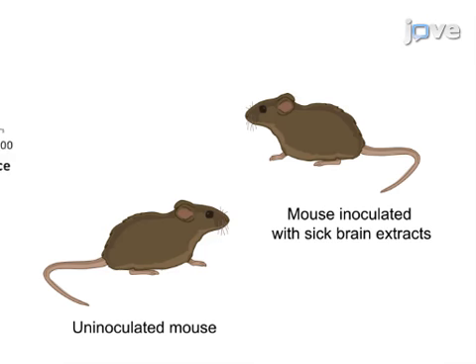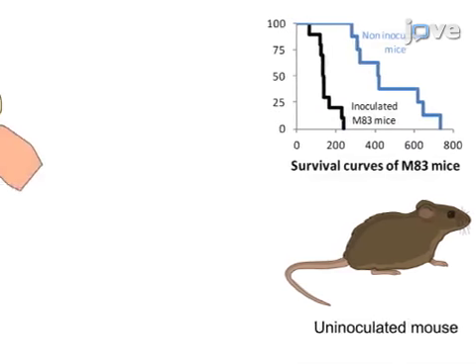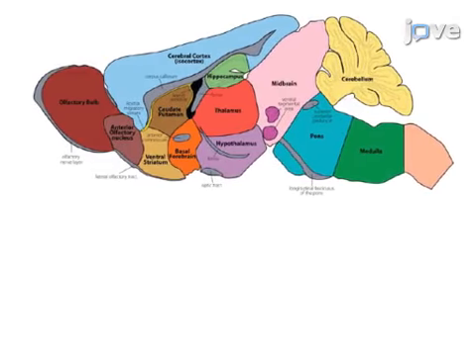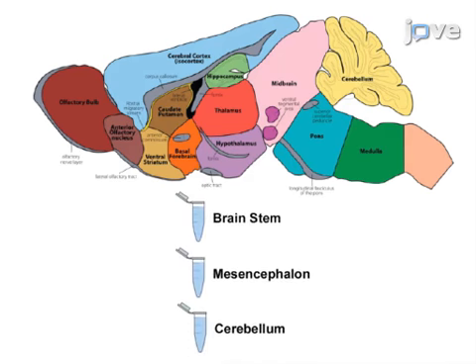from sick M83. After the mice develop clinical disease and are sacrificed, brain regions from the mice are dissected. Next, homogenates from each brain region are prepared in high salt buffer and ELISA is performed on the homogenates in order to quantify the disease-associated α-synuclein in each brain region.